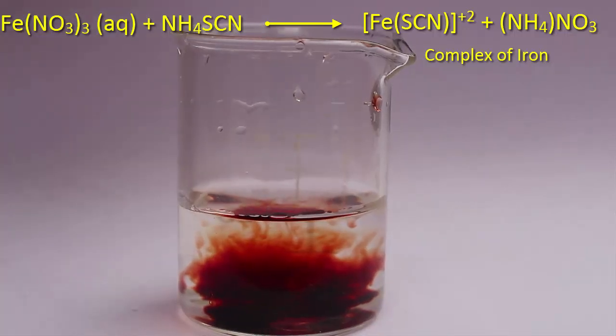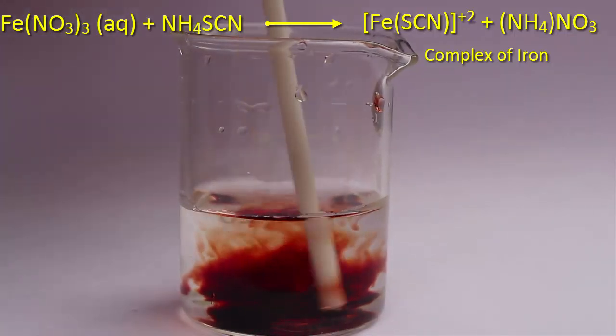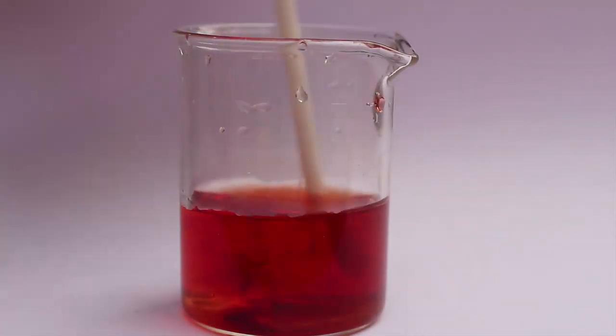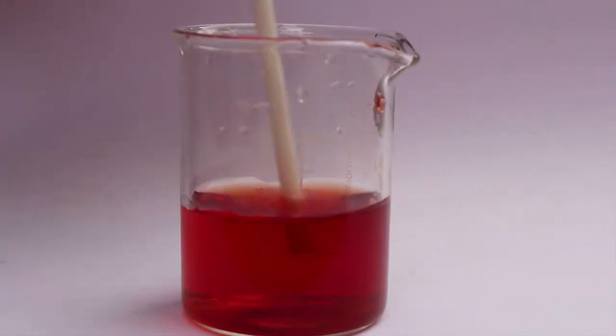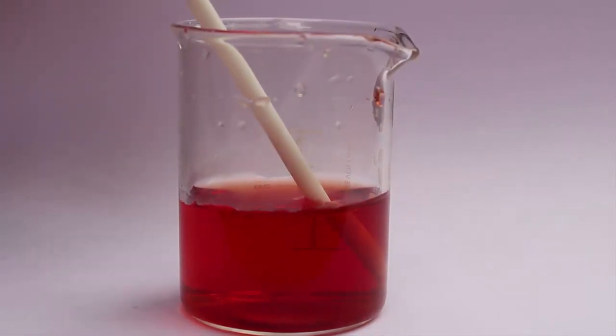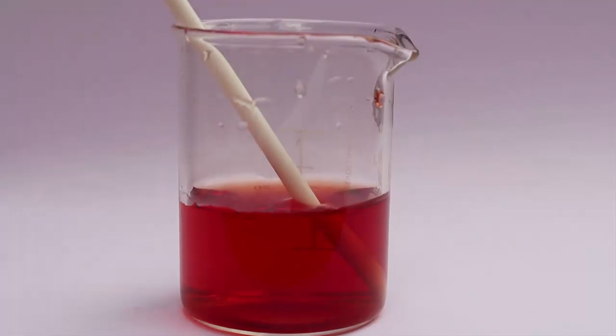Now if we stir the solution very slowly, we can see the whole solution color becoming red, just like our blood — a beautiful solution of the chemical which gives a blood-red color.